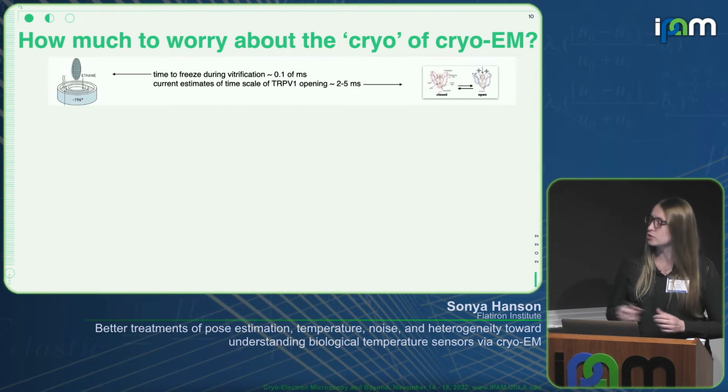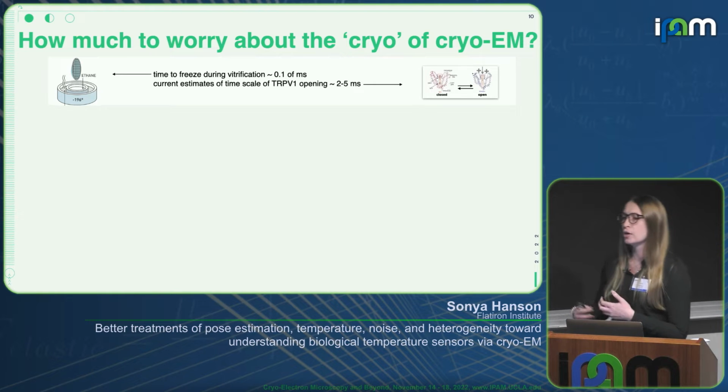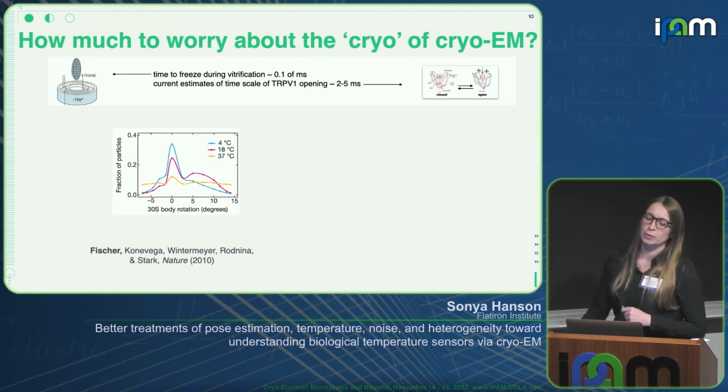But there are other questions here, such as the column of air above the liquid ethane. Is that going to increase the amount of time that these samples are exposed to very high temperatures? These are things we don't really 100% know yet, but there's been some promising work.